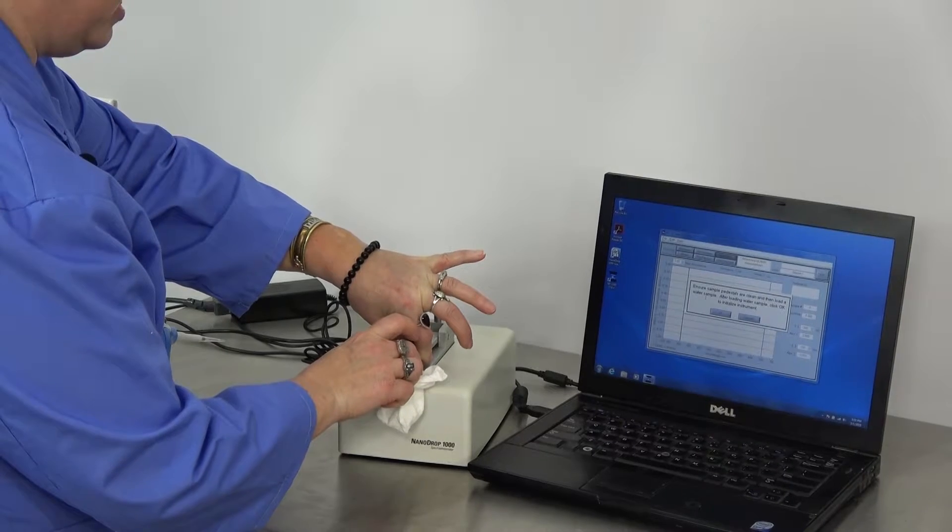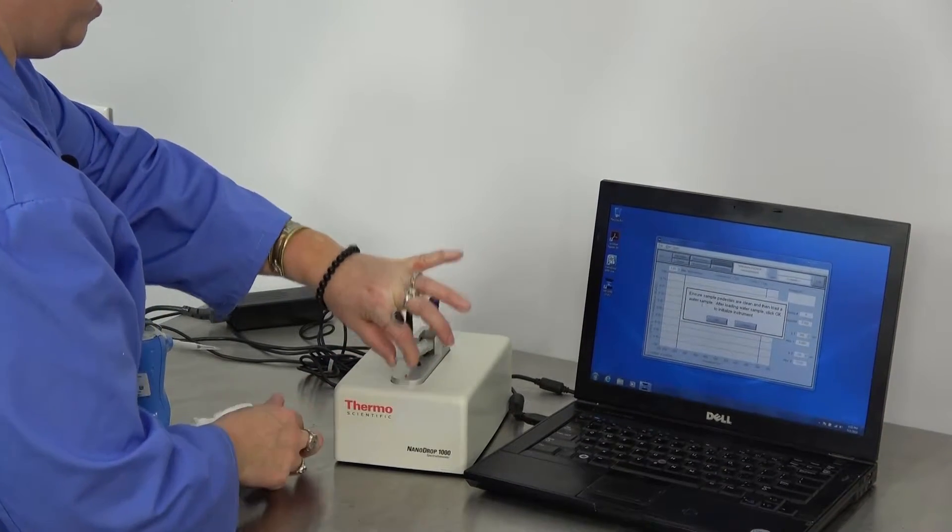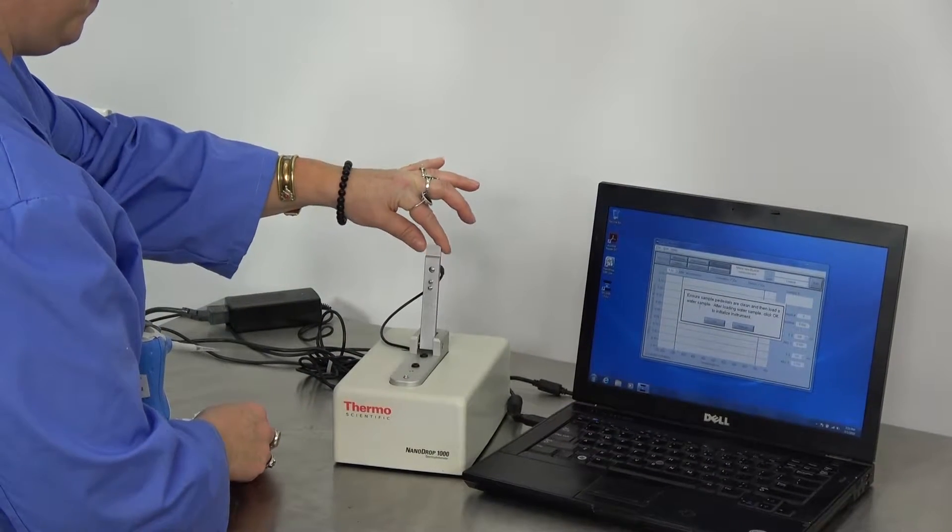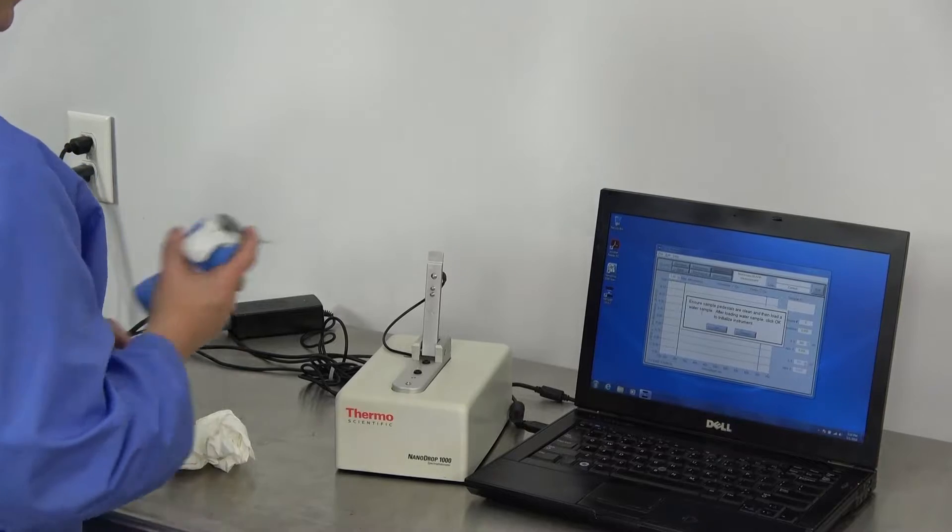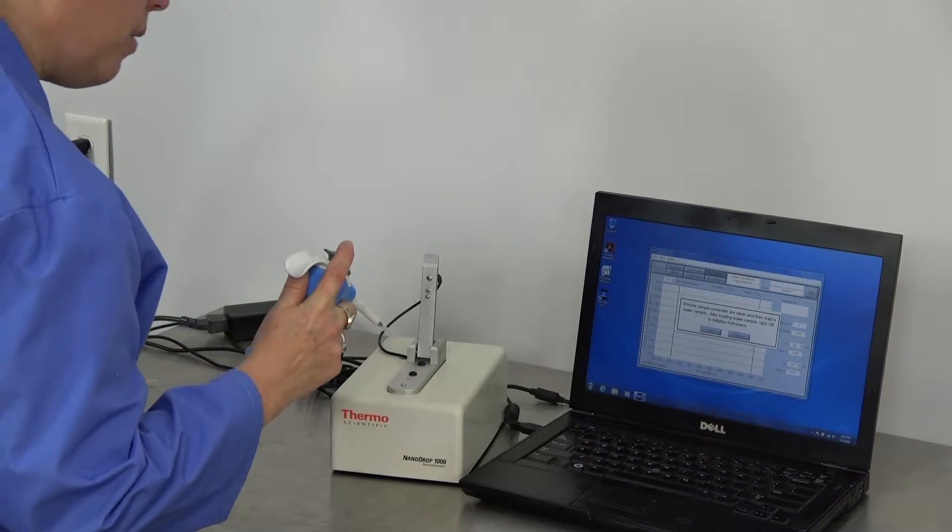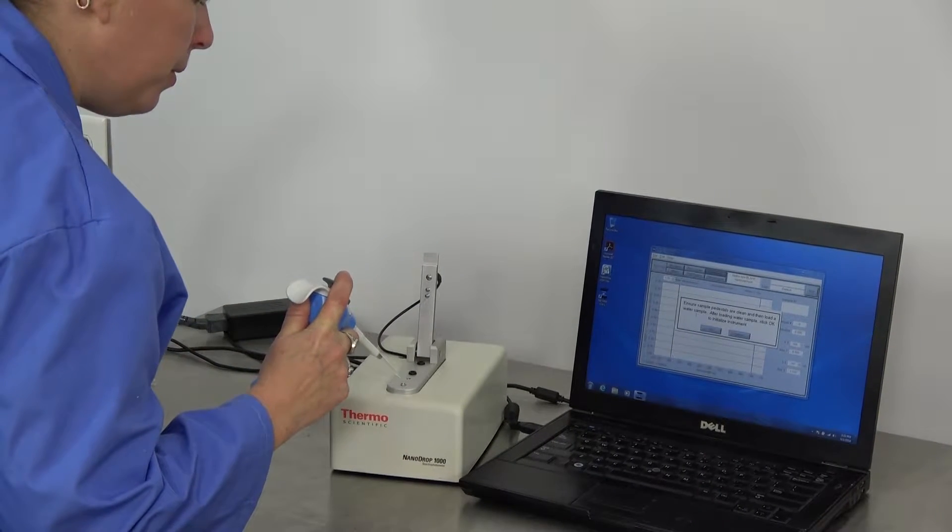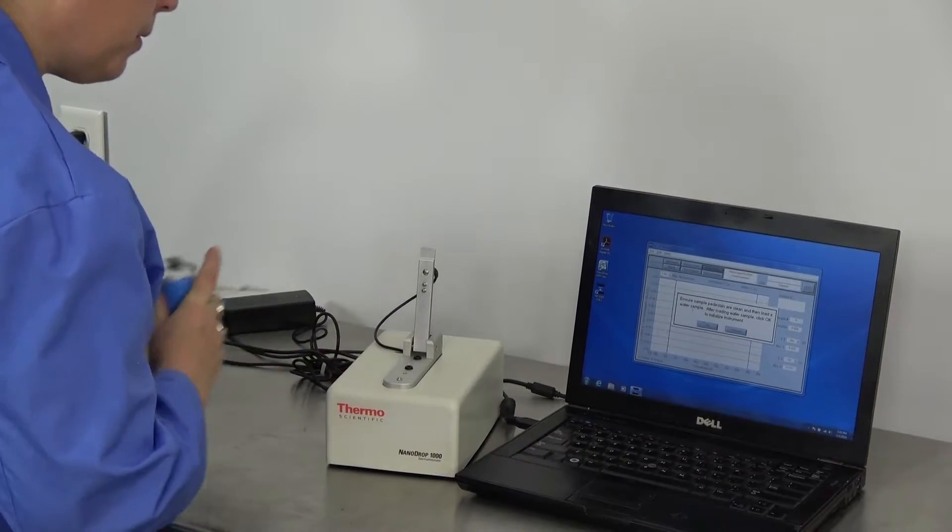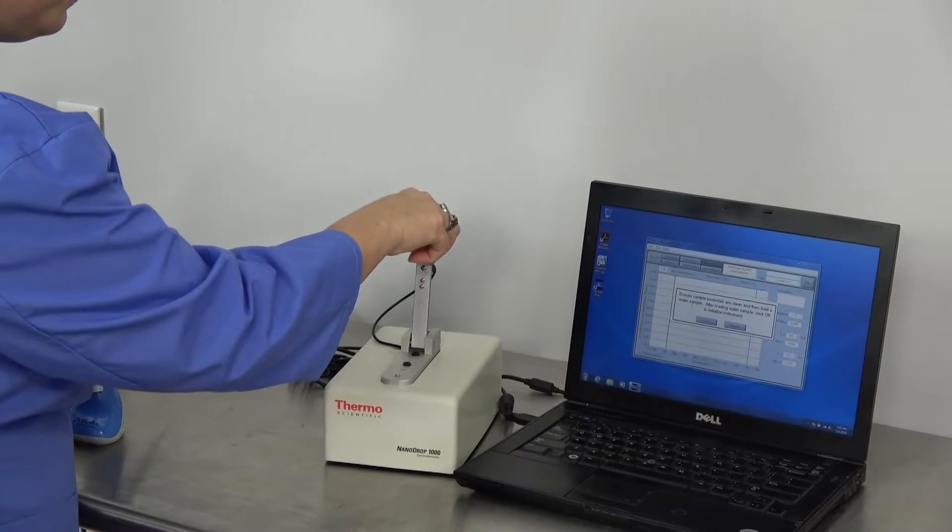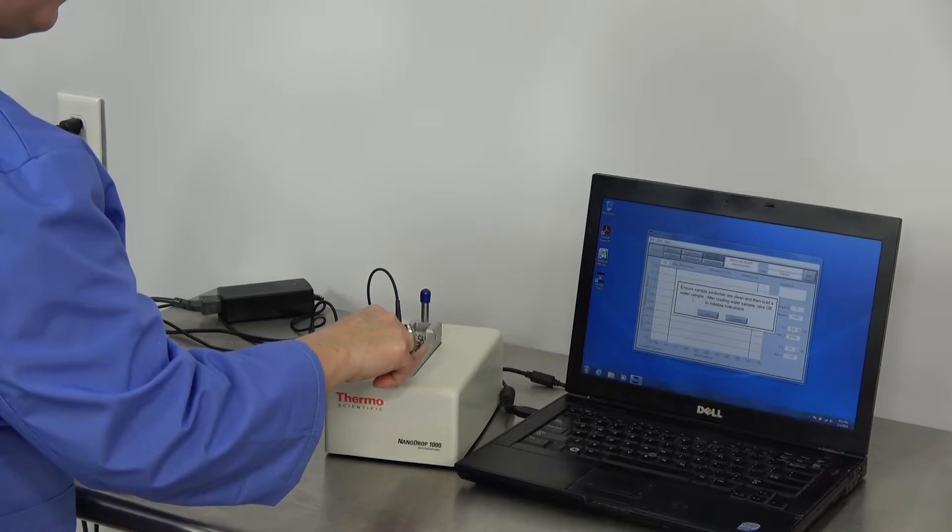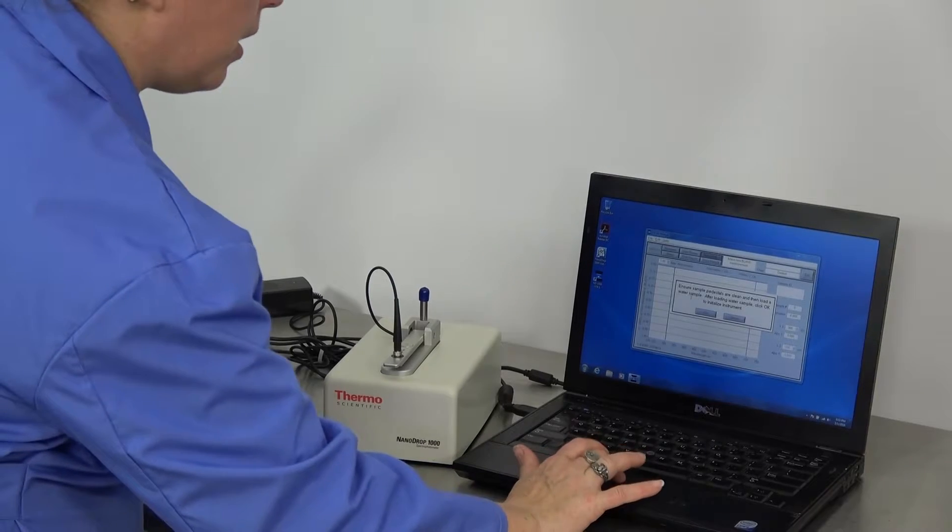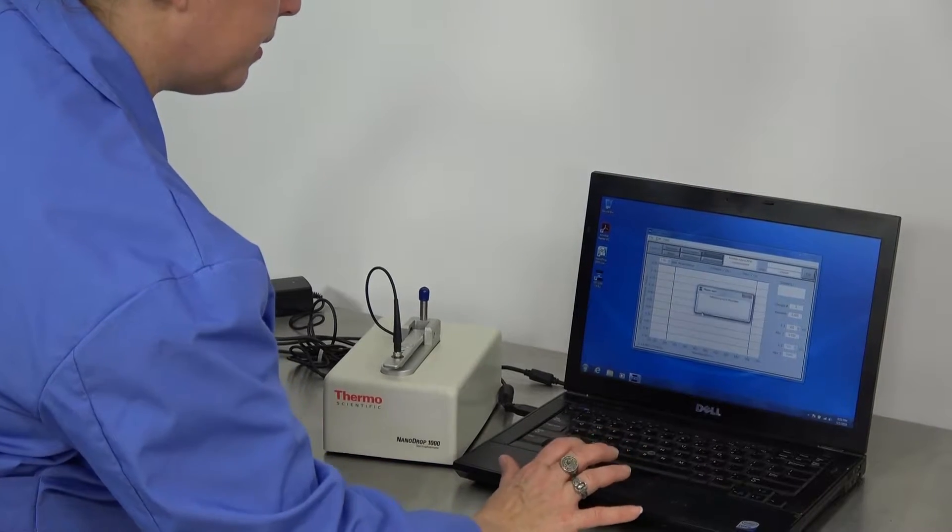Use a lint-free cloth or Kim Wipe. And then load a water sample. We're going to click OK to initialize.